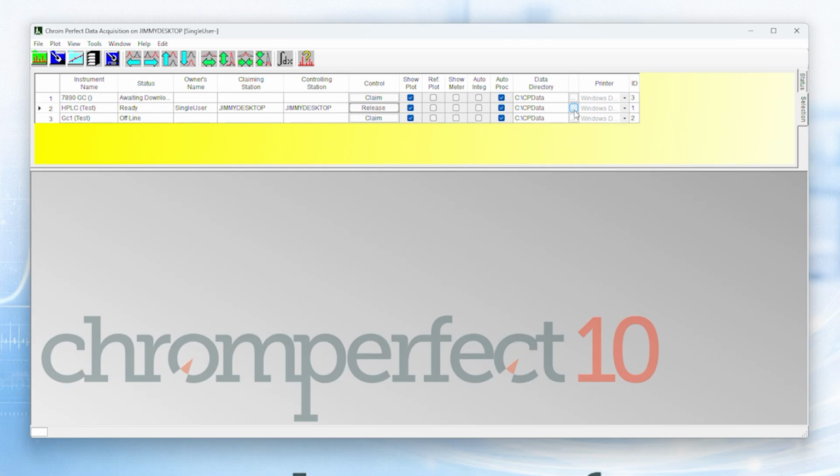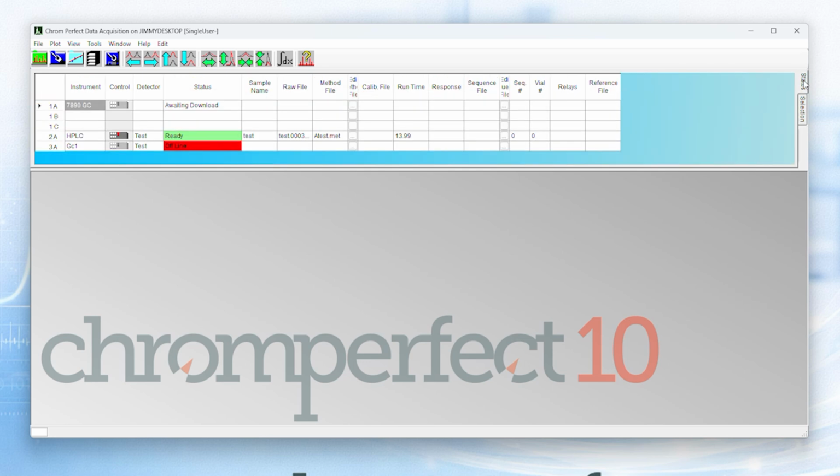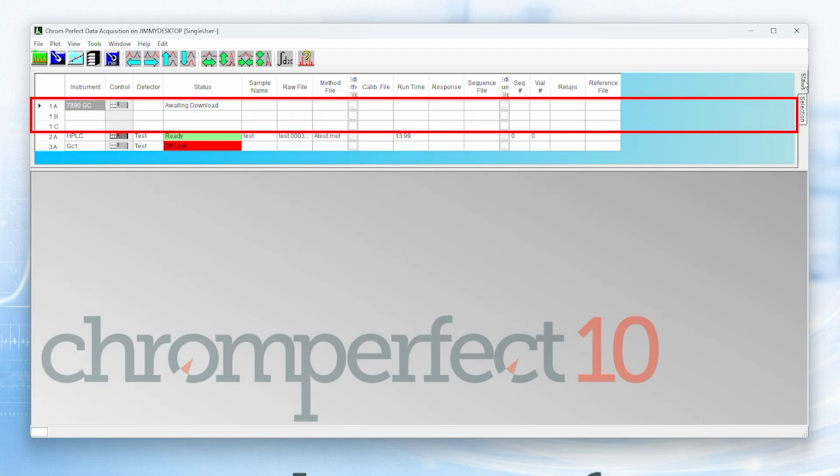On the Selection tab, the list is shown one line per instrument because selection is concerned with the instrument itself and does not expand by detector. When you switch to the Status tab, the spreadsheet may show additional lines if multiple detectors are configured, because Status displays acquisition state per detector channel.